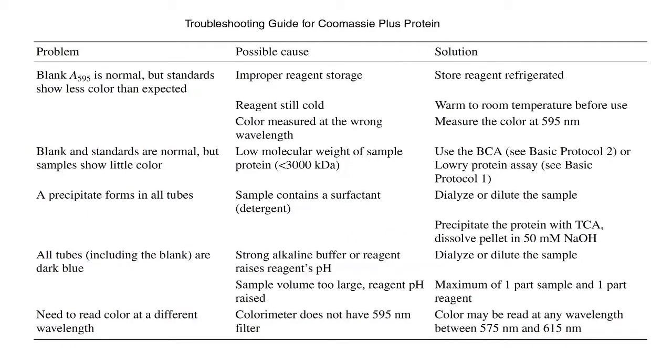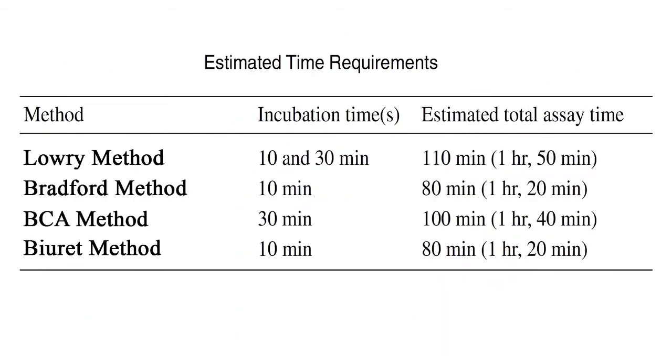In this slide, you see possible causes of incorrect protein measurements by the Bradford method. Compare the assay times.